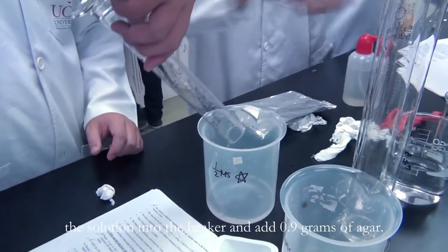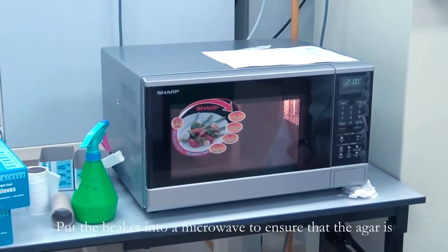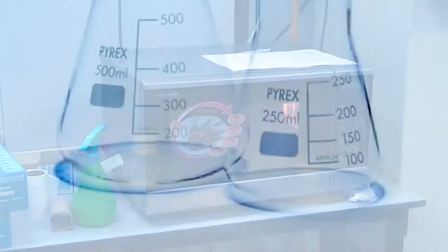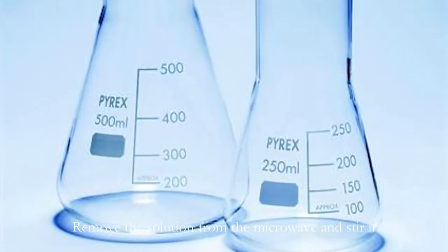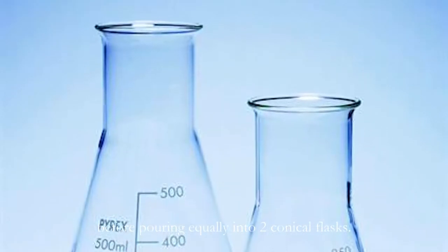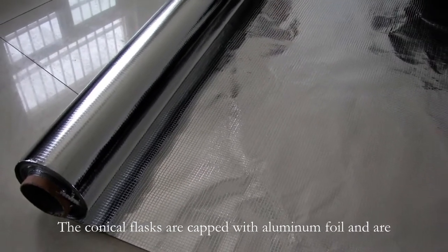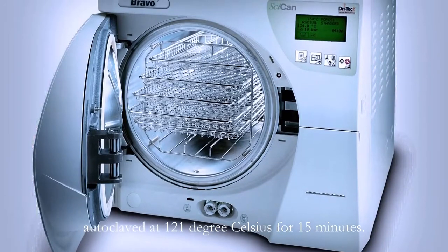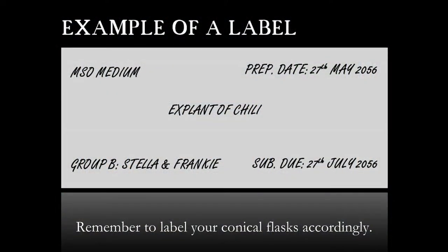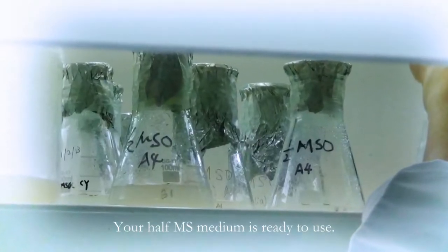Pour the solution into a measuring cylinder and top up with distilled water to 100 ml. Then return the solution into the beaker and add 0.9 grams of agar. Put the beaker into a microwave to ensure that the agar is completely melted. Remove the solution from the microwave and stir it before pouring equally into two conical flasks. The conical flasks are capped with aluminum foil and are autoclaved at 121 degrees Celsius for 15 minutes. Remember to label your conical flasks accordingly. Your half MS medium is ready to use.